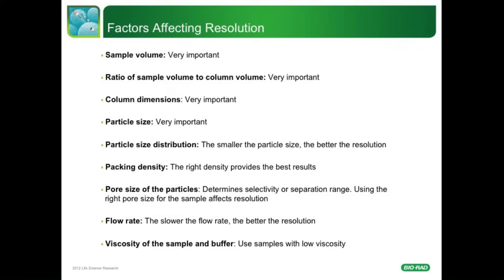Pore size of the particles. The pore size of the particles determines the selectivity or separation range of a size exclusion column. Using the right pore size for the sample affects resolution. Flow rate. The slower the flow rate, the better the resolution. Viscosity of the sample and buffer.